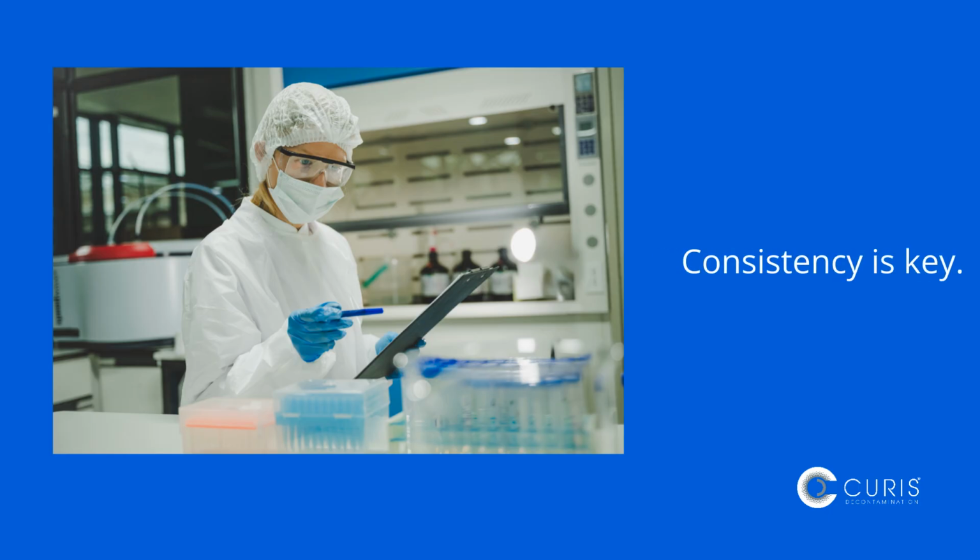Consistency matters. A routine schedule based on lab activity and contamination risk helps prevent gaps in coverage. And training is essential. Every person in the lab must follow the same protocol the same way, because variability is one of the fastest paths to contamination failure.